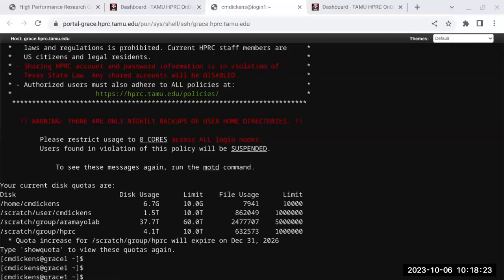So single end, paired end, we'll cover this in one of our job scripts. Single end sequencing basically is just you have a double-stranded DNA and you're only going to sequence one strand.